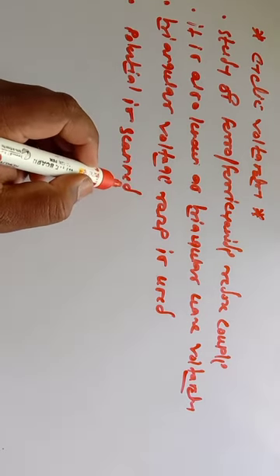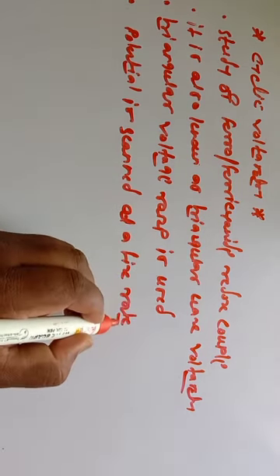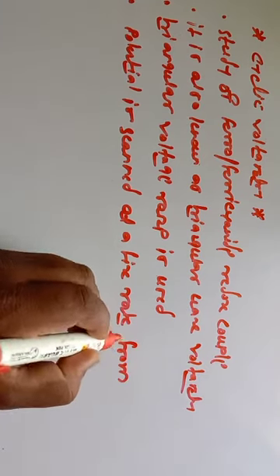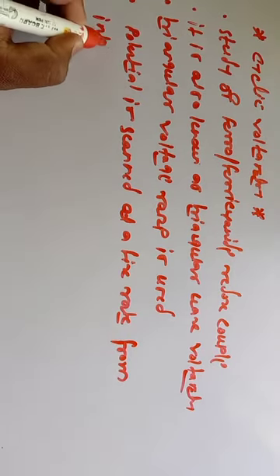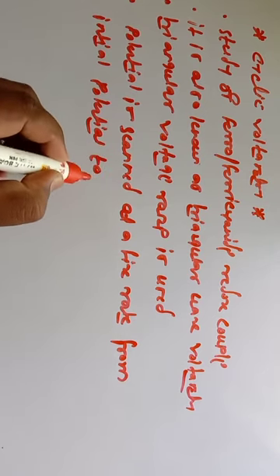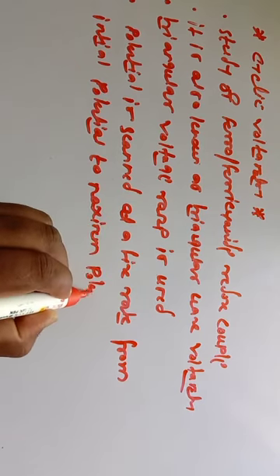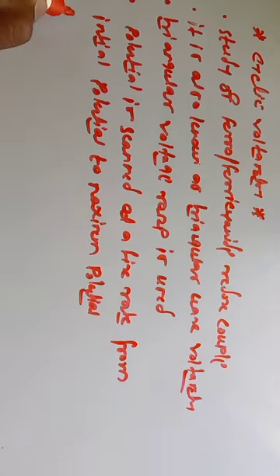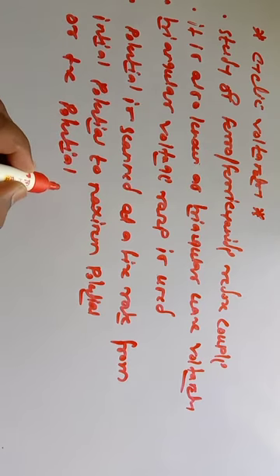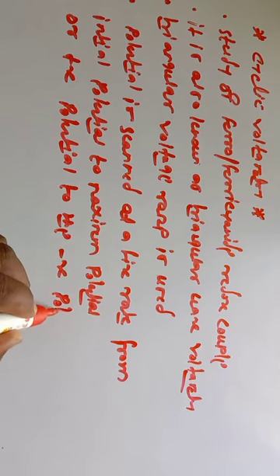Potential is scanned at a fixed rate, from initial potential to maximum potential, or positive potential to the negative potential.